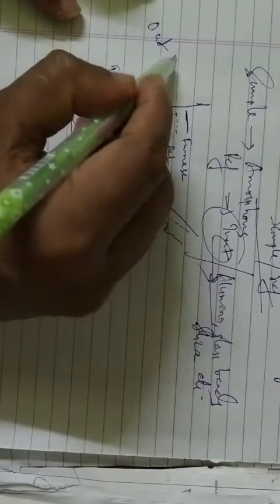Now this is the output of a potential, whatever we are going to get. This is important here. With the help of the thermocouple, as we vary the temperature, this is the result we are going to get. So this is plot A. What is this?